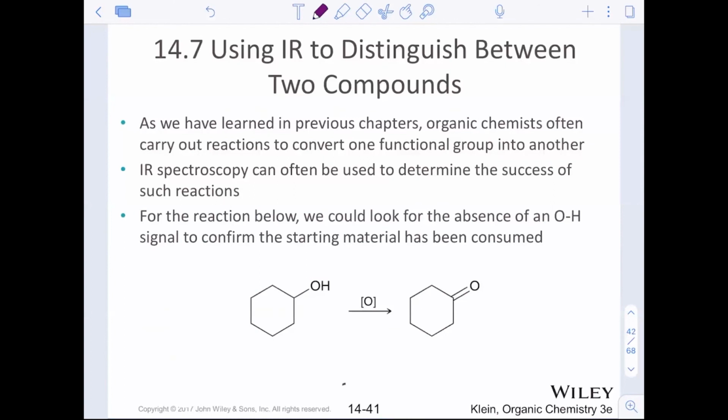Clear liquid, making a clear liquid? How do I know? We typically use IR spectroscopy for that. So that's what we're going to be at the end of the day trying to use IR for. Not only is it to decipher unknown compounds, but it is to distinguish between reactants and products. How do we know when our reaction ends? Excellent.